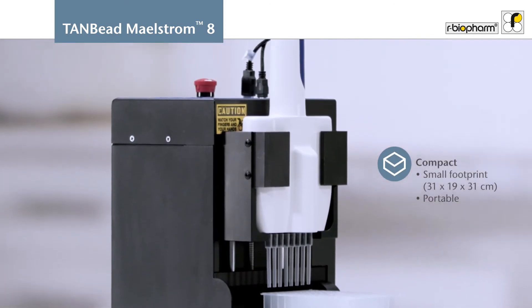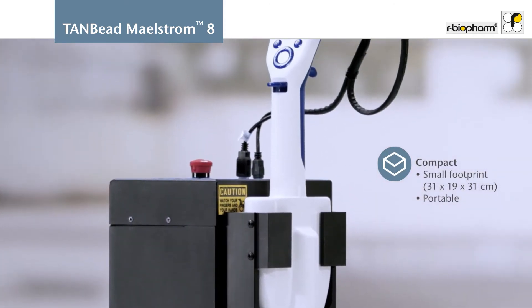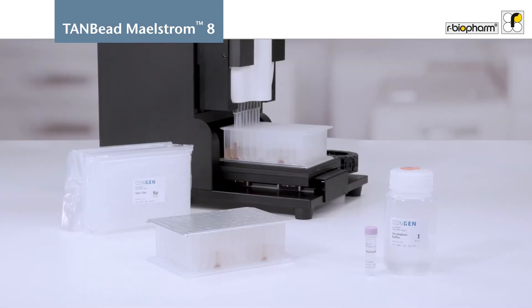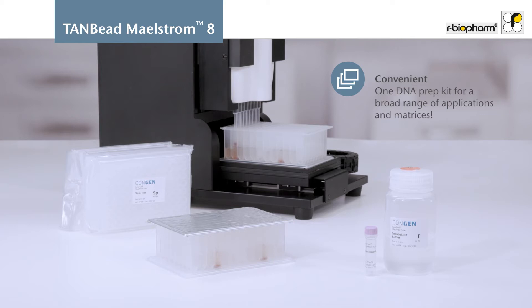The M8 AutoStage is an easy-to-use and portable benchtop instrument with a compact size. No more thinking about which nucleic acid preparation kit and protocol needs to be used.